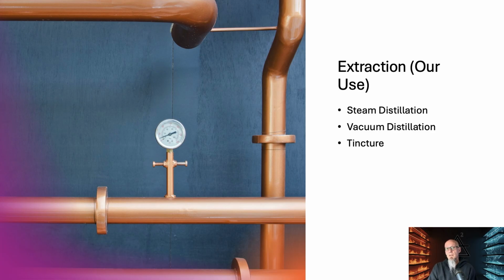So, like I stated earlier, we would generally boil our water and get it up to 100 degrees Celsius, and then the steam would pass through. So our boiling point needs to be below that is where I'm going. If we're doing standard steam distillation, our boiling point needs to be below that because that's the boiling point of water, right? That's where our steam's going to come from.